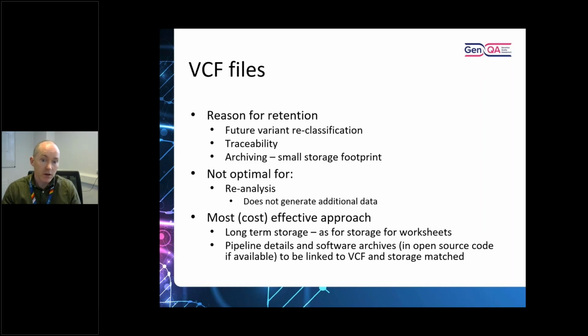The most cost-effective approach here is long-term storage, same for worksheets. It doesn't cost a lot to store, and I would store it pretty much as long as I would store the worksheets, on the same basis. It could be 20 years in some cases, but that's reasonable because the files contain enough information that you can go back and reanalyze within limitations of your pipeline, and you have all those variants and everything is traceable, and it's a perfectly reasonable file, I think, to keep for a long time.